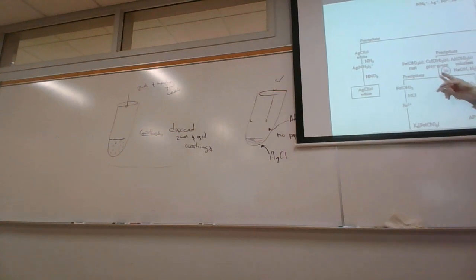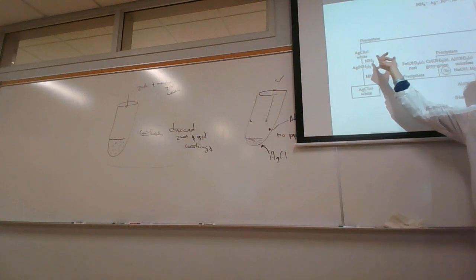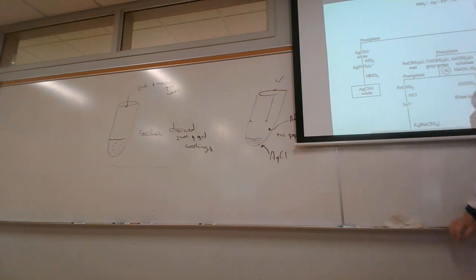Also, when we do the precipitate, we add until it stops precipitating. How do we know when it stops? Centrifuge test. That's how we know when we're done. And so, like I said, I don't put the amounts, but once I know the amounts, for example, approximately how many drops of HCl it takes, I'll write down how many drops. That way, in the future, I know about how much I need to add. Does that make sense there? Okay.